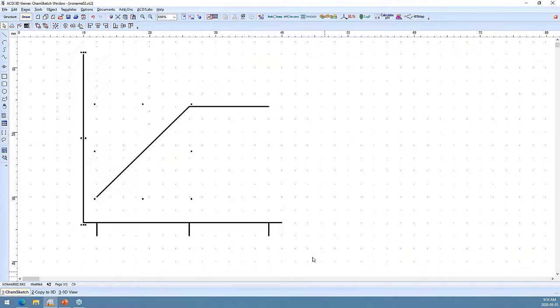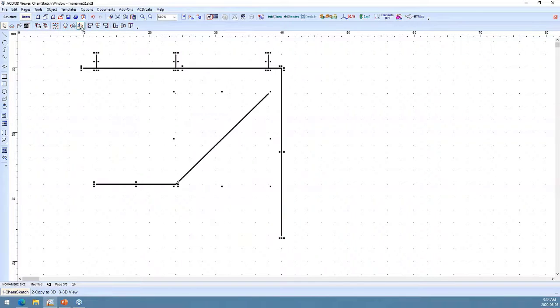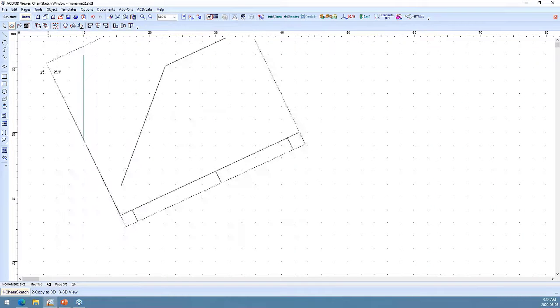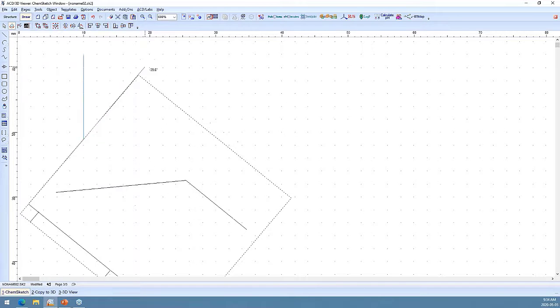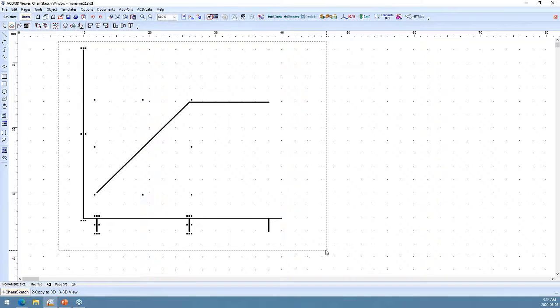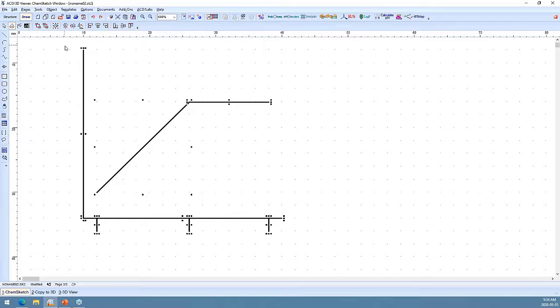You can also use the buttons to rotate everything. So if I select this now, and then I use this button here, you'll see that I can just rotate it 90 degrees. So that's better than, for example, using the rotate button, because if I try to rotate this now, it's going to be more difficult for me to get exactly 90 degrees because I have to use my mouse to do that. Another tool that's useful in draw mode is the group button.